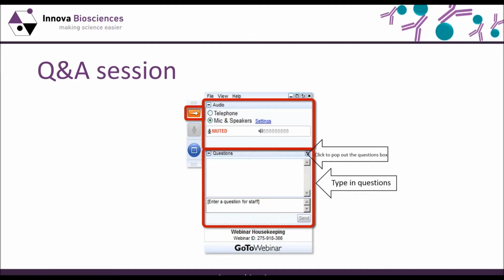So how can I confirm that my antibody to oligo conjugation has been successful? The best way of doing this is to use the conjugate in your downstream application, but it's also possible to analyse your conjugate by gel electrophoresis. If you run a small amount of the conjugate on a reducing SDS-PAGE gel and then stain that for protein, you should be able to see the heavy and light chains of the antibody, and those will demonstrate a band shift when they're bound to the oligo. Obviously, the size of the band shift will be dependent on the size of the oligo.